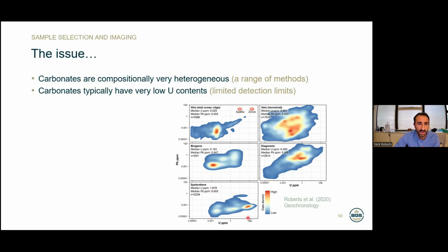Speleothems are a little bit higher. We're actually averaging almost 2 ppm on these examples. Detection limits vary: some instruments are 1 ppm, some are 10, some are 100. That's one of the reasons that finding uranium is quite hard, and it's hard to screen carbonate materials.